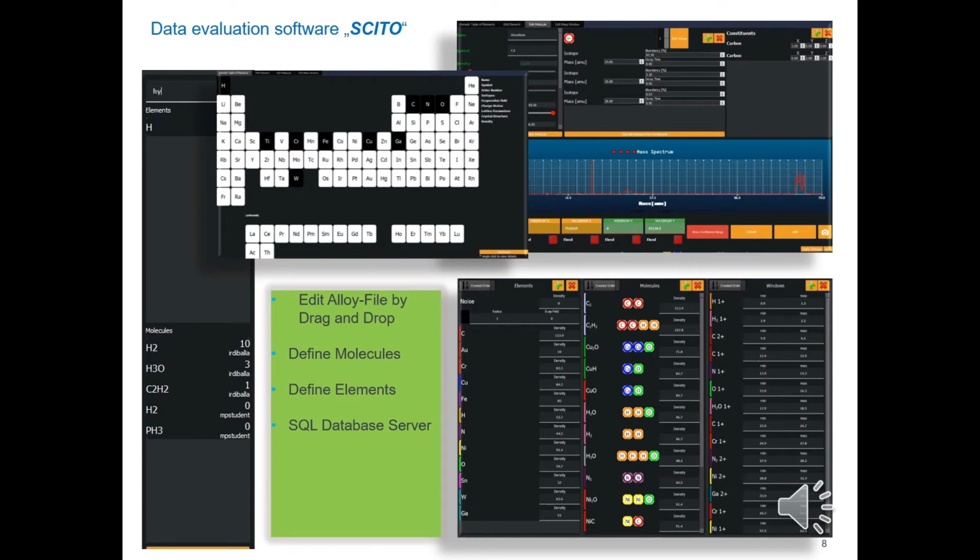And if you are a very nice, kind person, you can also upload this to the SQL server so that anybody that is searching for a special name or a short name can have a look at what's already stored for this respective element in the database. So they can reuse your definition of molecules and, of course, download them and, if necessary, change the parameters again for local use and store a second version onto the server if you are not happy with the first version.